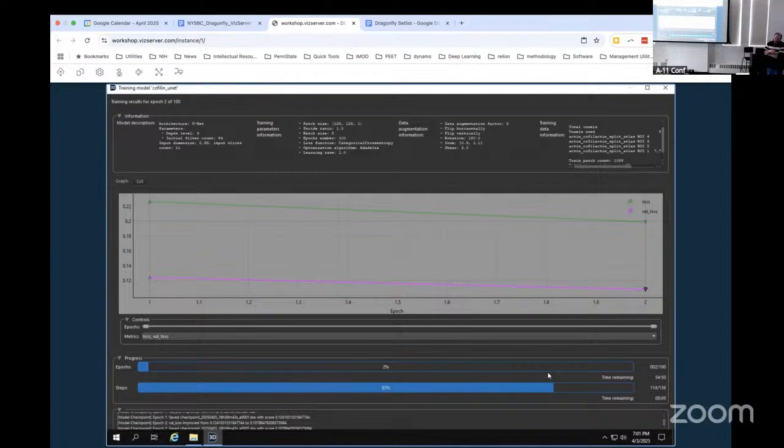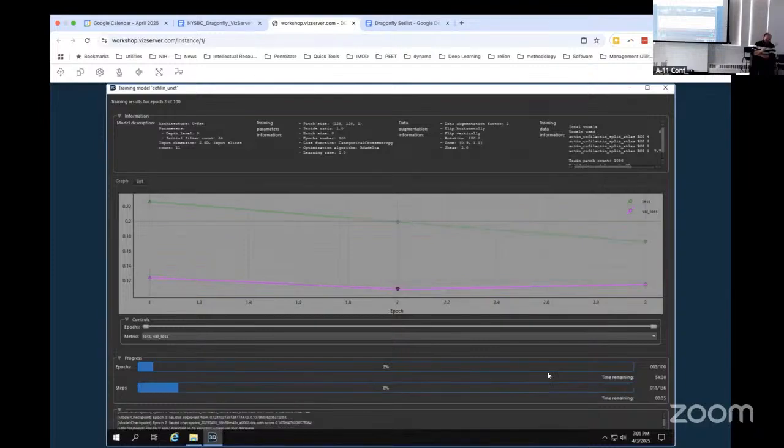On the basic, under that training tab where you put the input and output? No, it's the next one, it's the training parameters tab. It is on the training data tab, but at the top of that one there's a nested tab inside it. Okay, I must have missed it. It'll be a fine network. We just changed the size of the patch really.